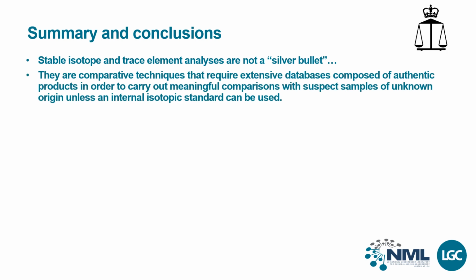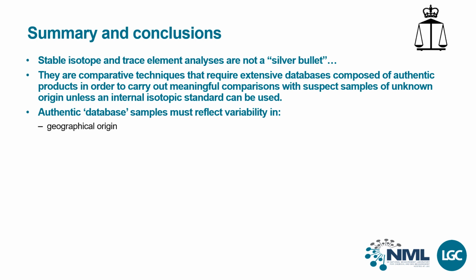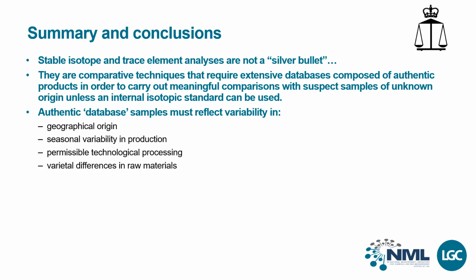It is a comparative technique that often requires an extensive database composed of authentic and contemporary products that allows meaningful comparisons with suspect samples. It is important that authentic samples reflect variability in geographical origin, seasonal variation, permissible technological processing and varietal differences in raw materials.